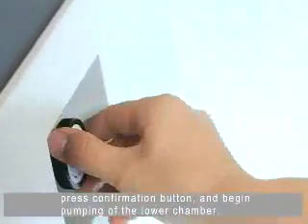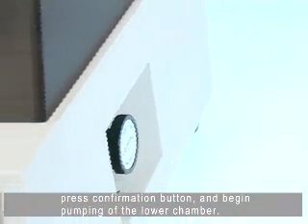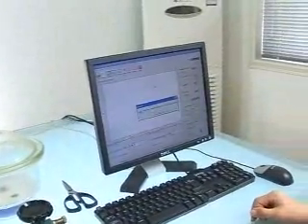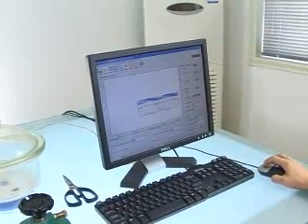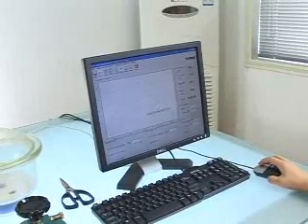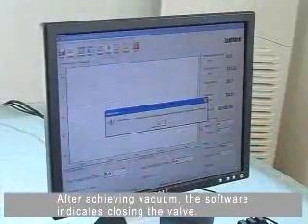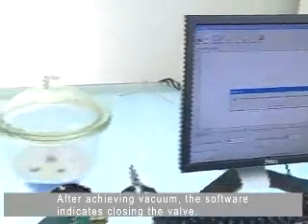After opening the valve, press the confirmation button to begin pumping the lower chamber. Once the vacuum is achieved, the software will indicate to close the valve.